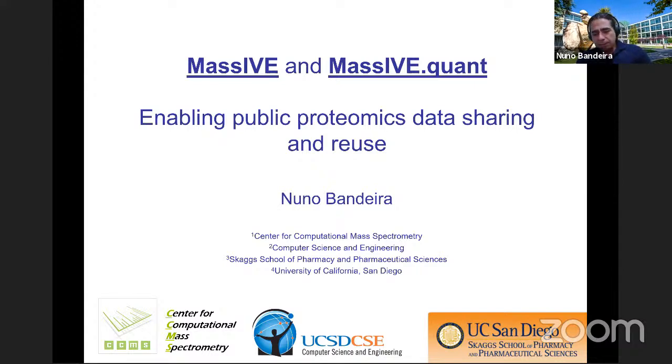So in the context of this topic, I'll start by giving a bit of an idea of where we're coming from with Massive. And then I'll talk about the Massive Quant effort that we put together to go more in this direction of having reproducible research, not just at the ID level, but also at the level of quant, which obviously is critical for the analysis of biological data.